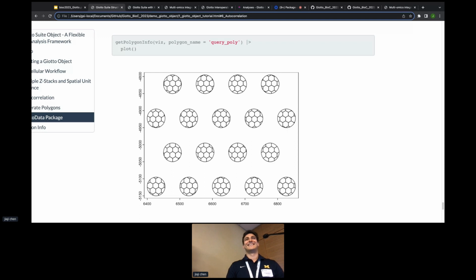I just want to ask, you have a bunch of things in Python and in R. So is the backend just, I'm curious how much of this can be isolated into one or the other. Let's say I'm running completely on AnnData and Scanpy, and I want my pipeline to go into Giotto. Do I have any R intermediaries which I absolutely have to run Python for my workflow?